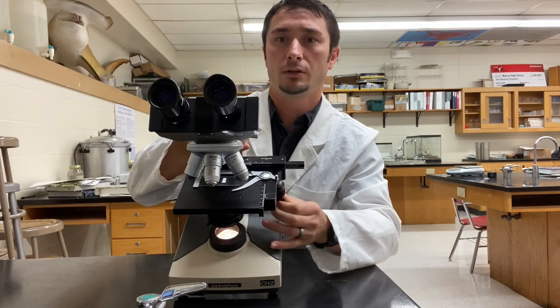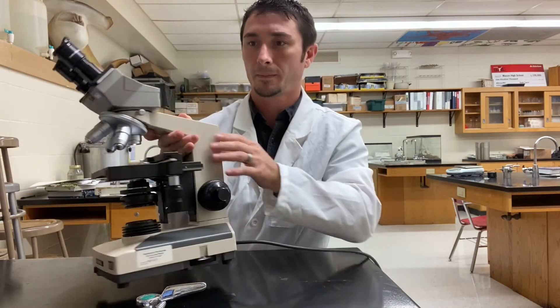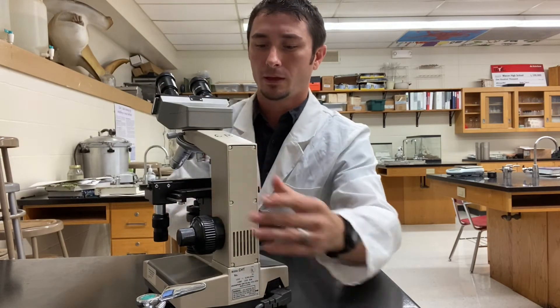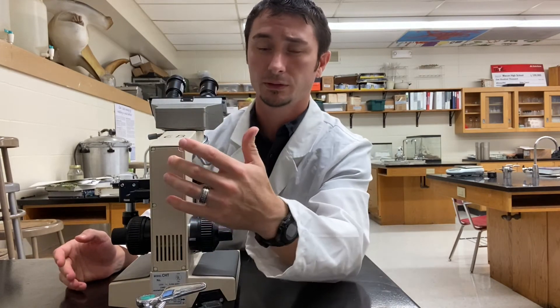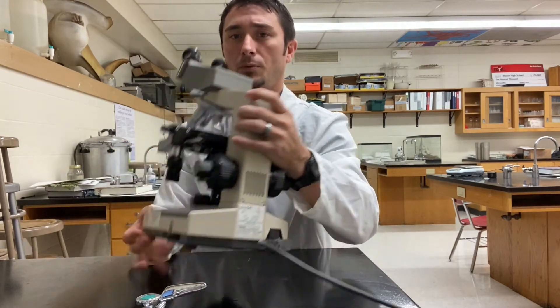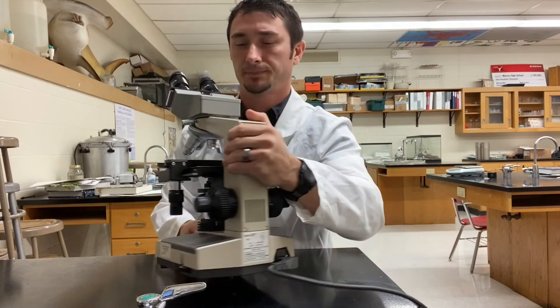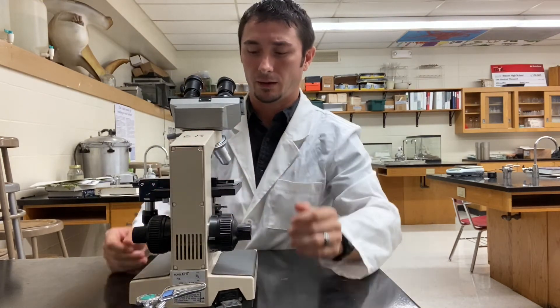You can see that little bar moves and the slide moves accordingly. Now when you go to carry a microscope, you want to be very careful because it's a high-dollar piece of equipment. You have the arm in the back and the base at the bottom. Always use two hands when carrying the microscope — one on the arm and one on the base.